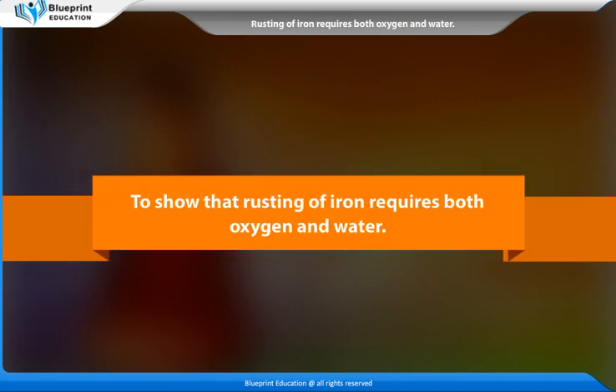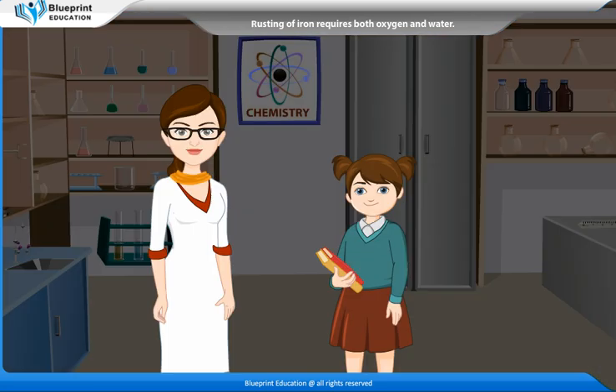To show that rusting of iron requires both oxygen and water. Madam, what is rust and why are oxygen and water necessary for rusting of iron?